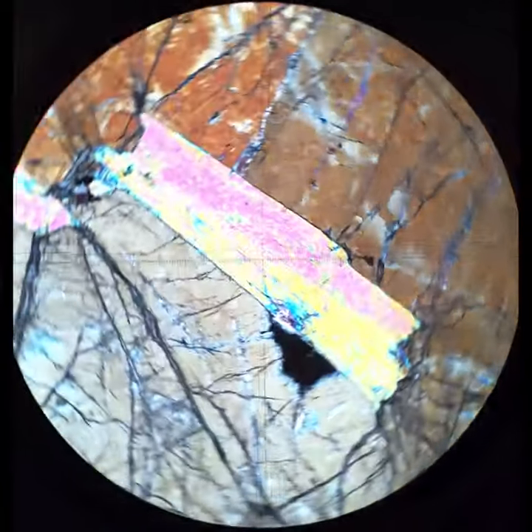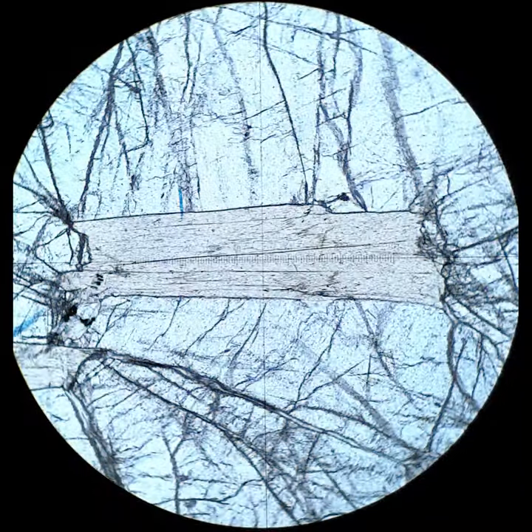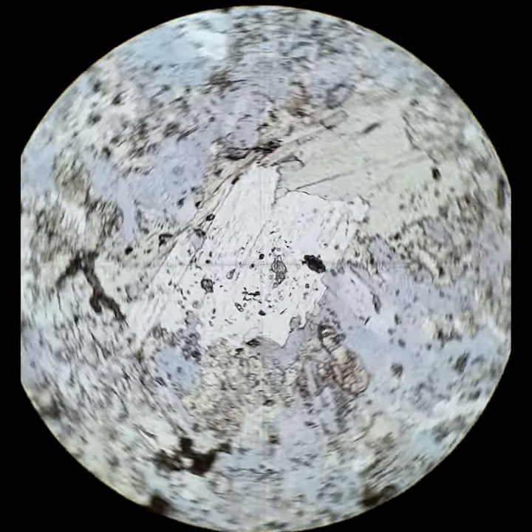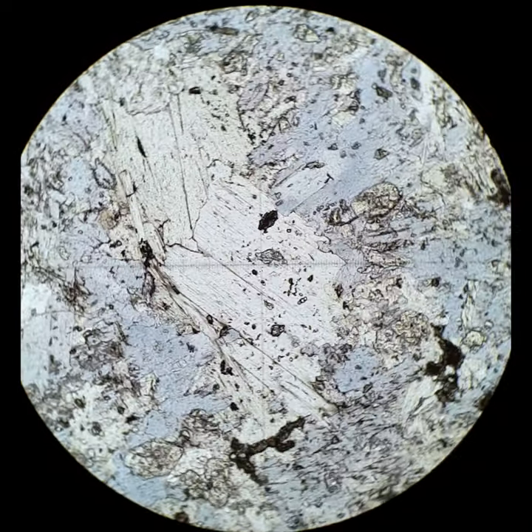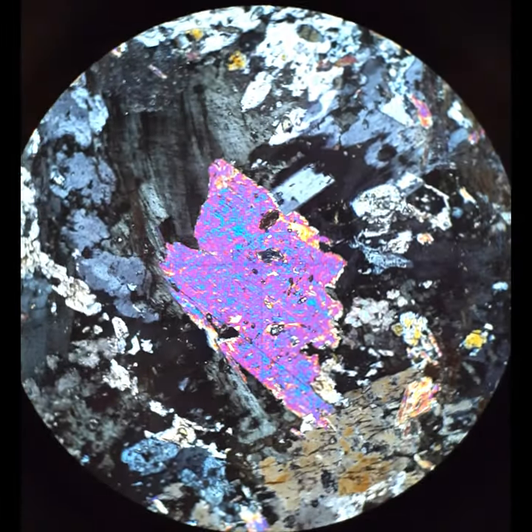Sometimes mica grains are oriented such that you can't see cleavage planes, and in those instances they can have unusual optical characteristics. Here, muscovite is in the center, and there's a pale green chlorite crystal that's off to one side. These both have one very good cleavage. The cleavage lines are very faint, but they're also distinctive.